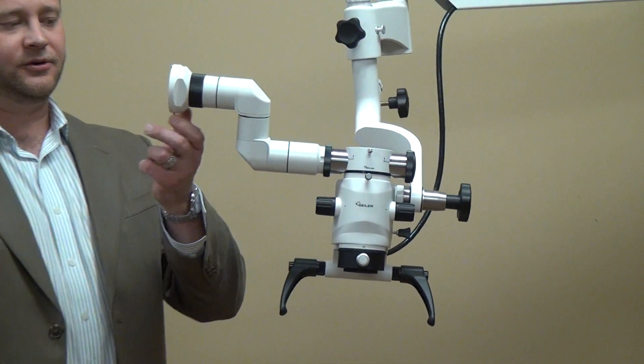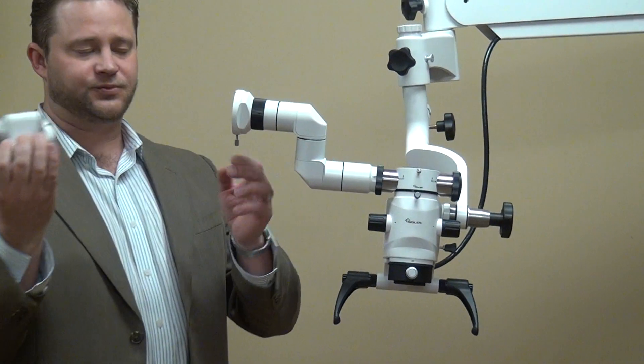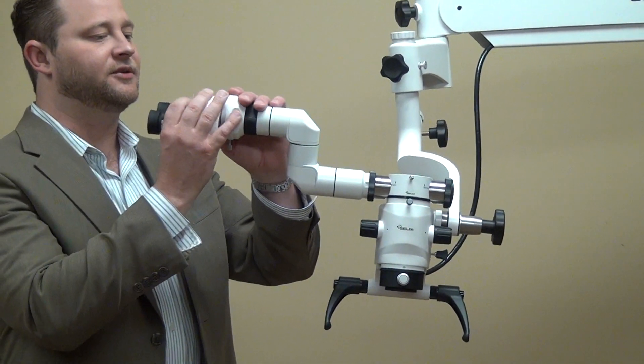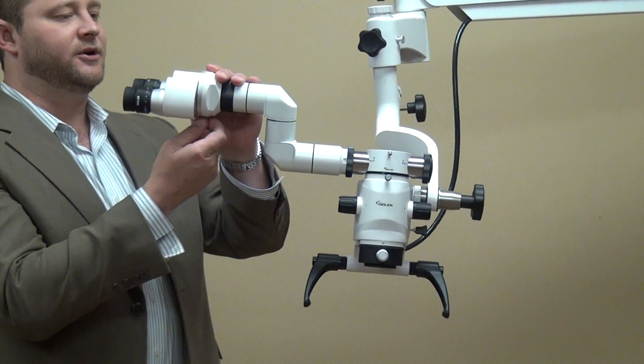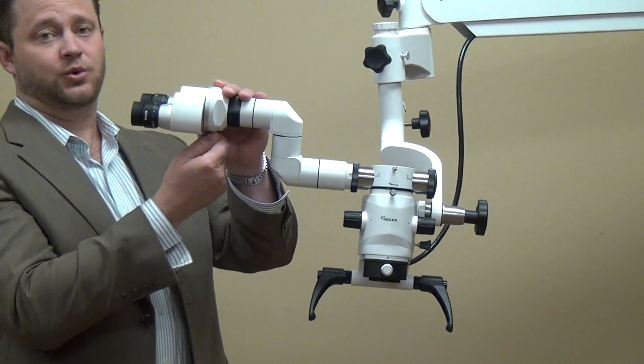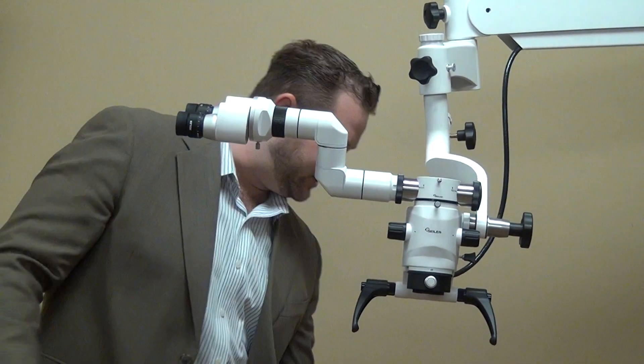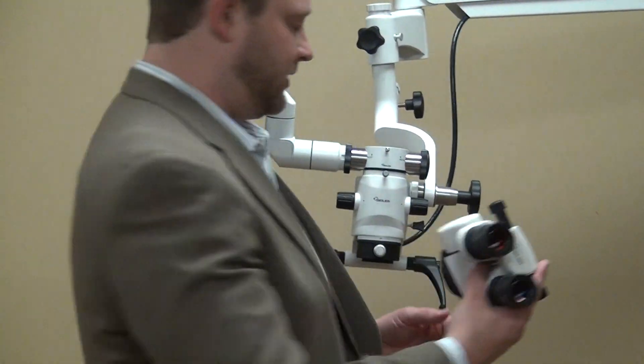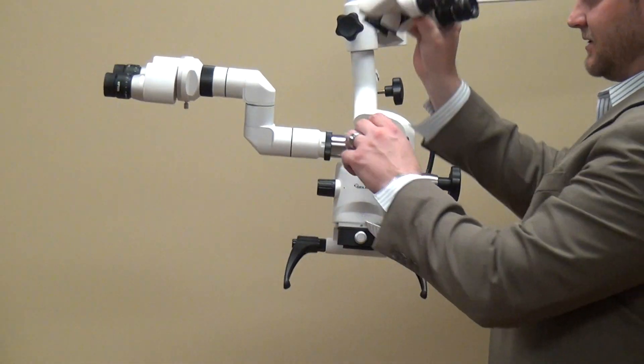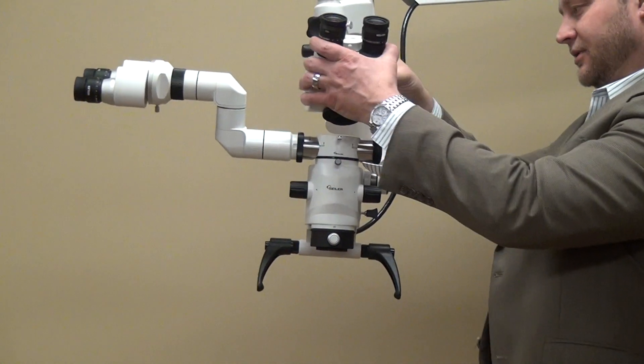And you put on your binocular head. We have just a simple straight binocular head. Remember we offer a 0 to 220 degree inclinable head that can go on, a fixed 45 degree inclinable head, or as we have here, a straight head.